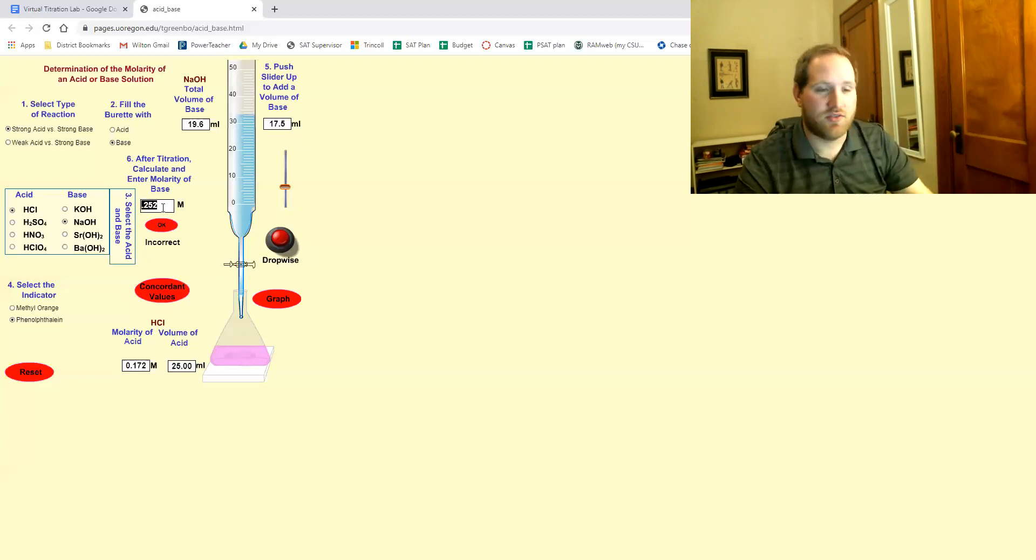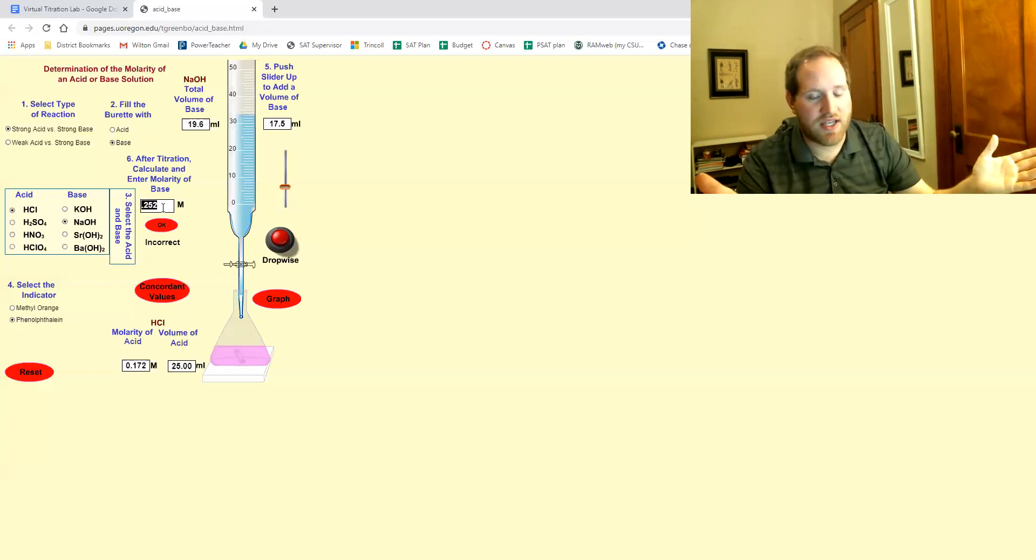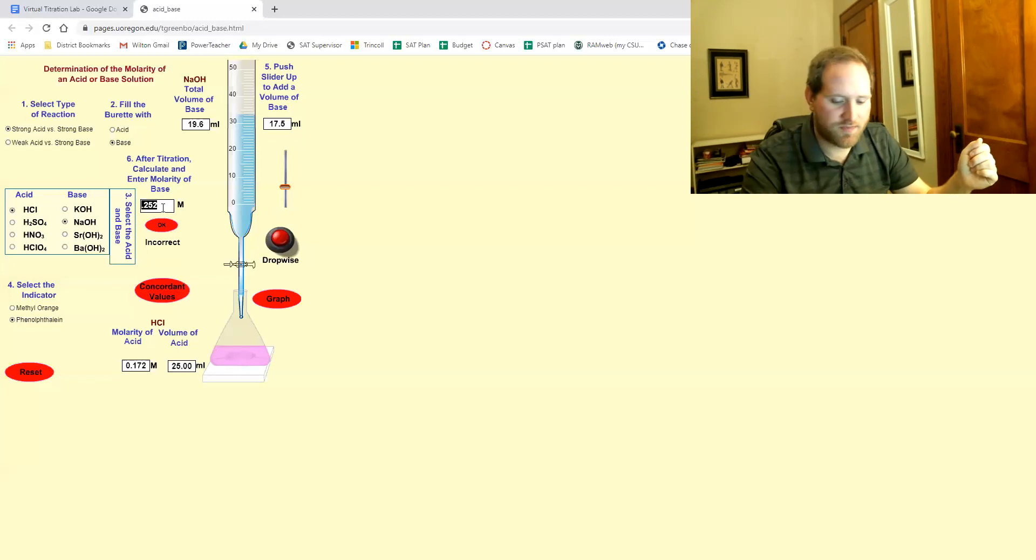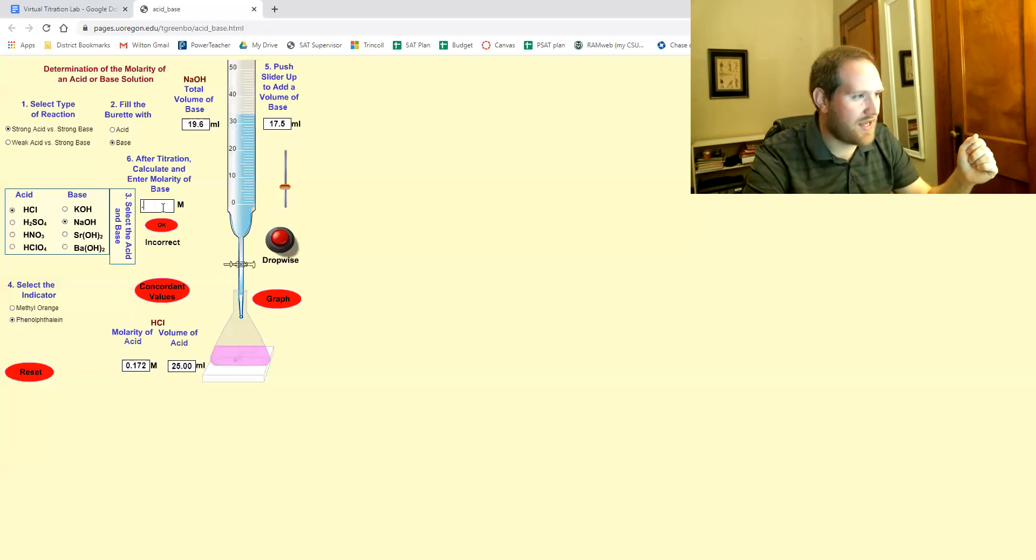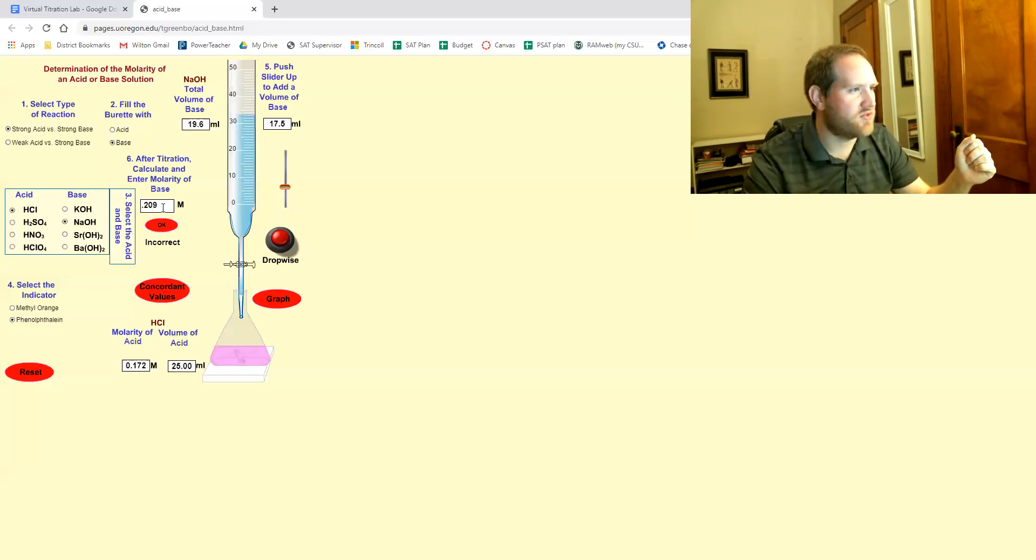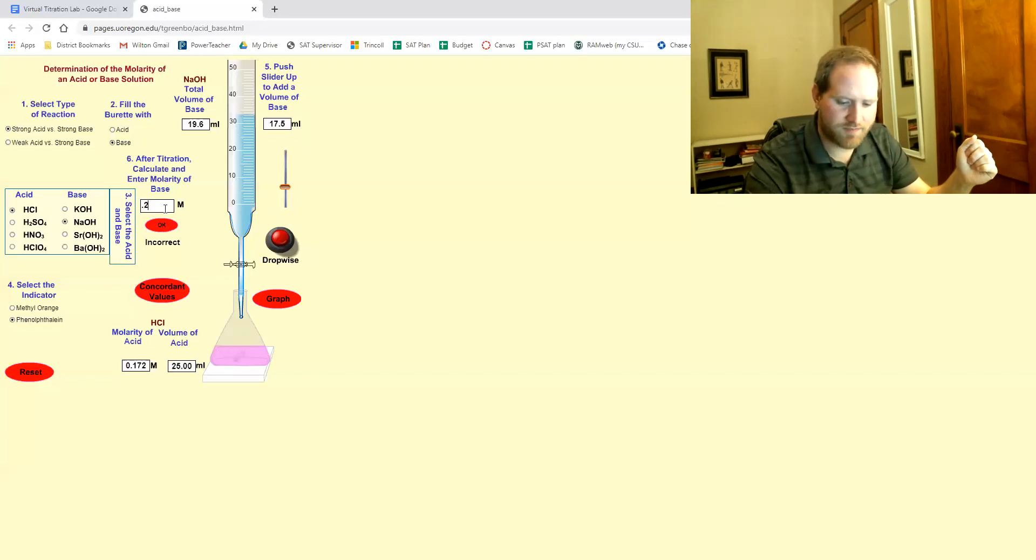And if you're still unable to get it, just hop into zoom, talk to your teacher. So let me put it back to what I happened to get before 0.209. No, was it 0.219?